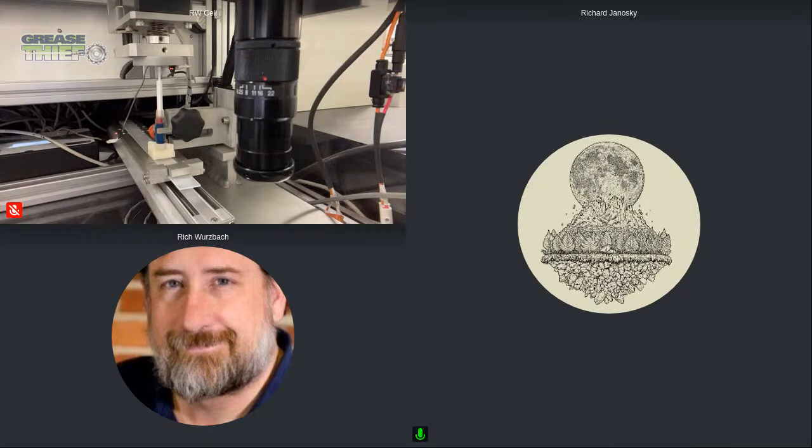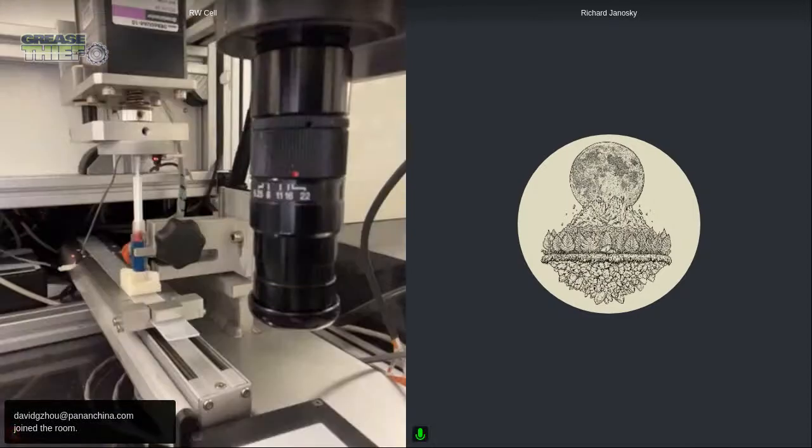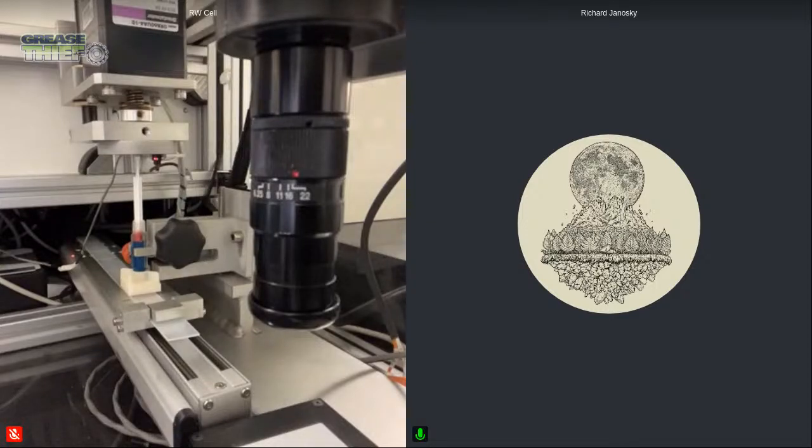So we've got the sample. And then you reoriented the extrusion die from when you first put it in. You spun it around. What's the significance there? Yes, I did. As we mentioned before, when we saw the grease extruding out in the thin film, if the extrusion orifice is not facing to the right, the grease would get smeared underneath of the extrusion die, and you would not have that nice thin film. Versus when the opening's to the right, the table carries the grease away as it comes out of the extrusion die.